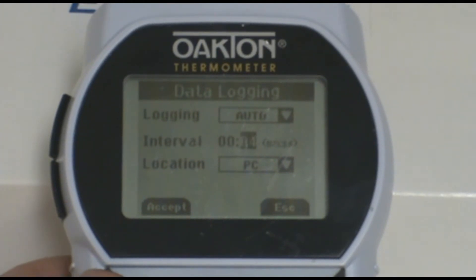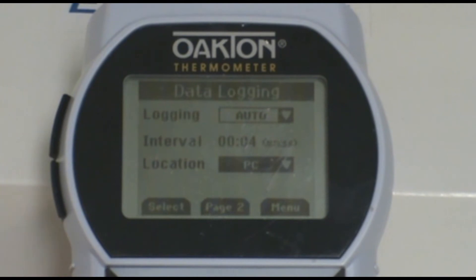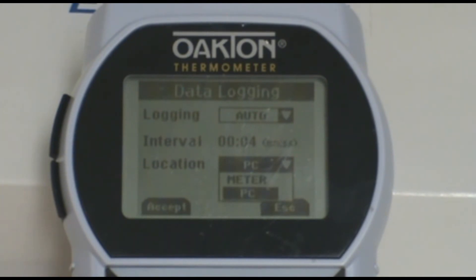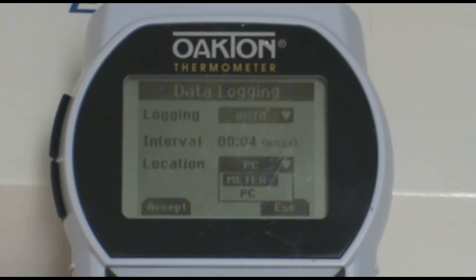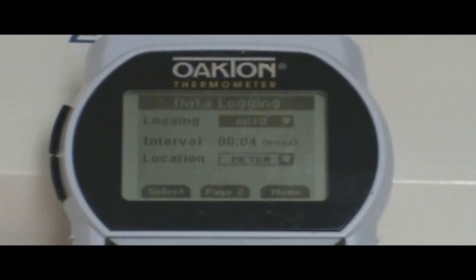For example, if the time interval is set to one minute, the meter will take a temperature reading every one minute and save that on the meter. If the logging is set to manual, this would require you to press the log button on the meter every time you wanted to save a reading.